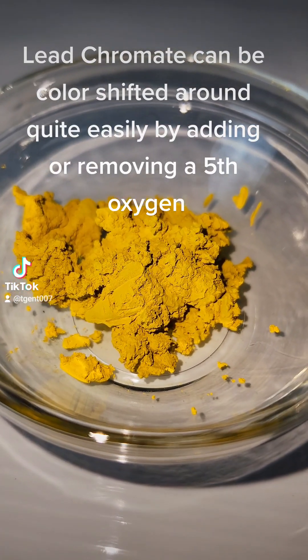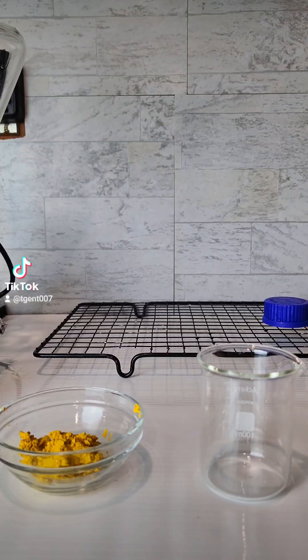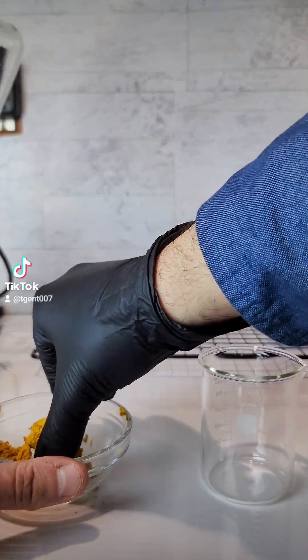Lead chromate can be color shifted around quite easily by adding or removing a fifth oxygen. This results in different shades of orange, and all you need to do is increase the pH.